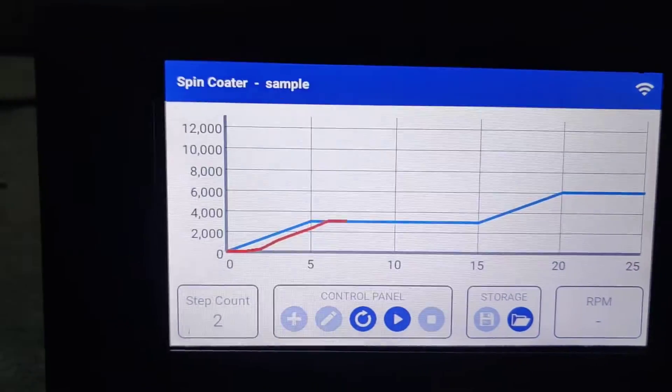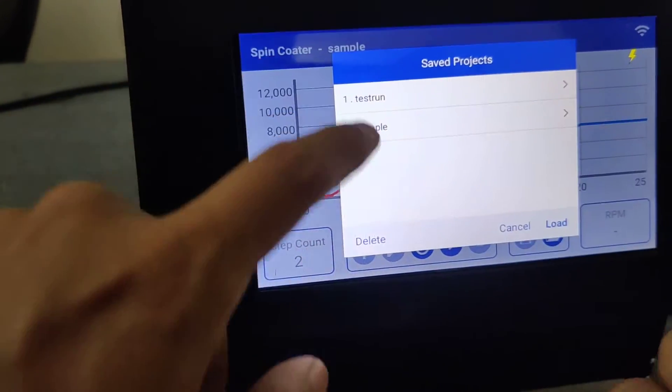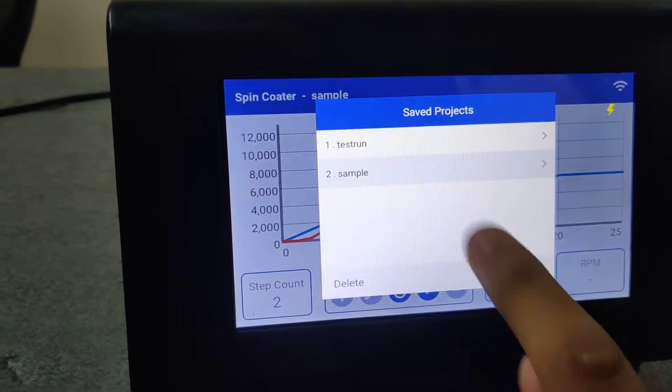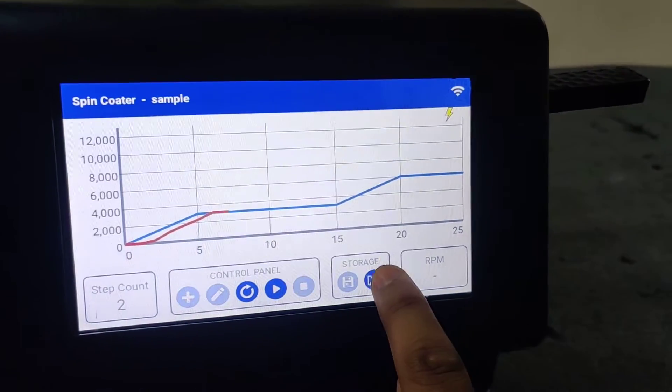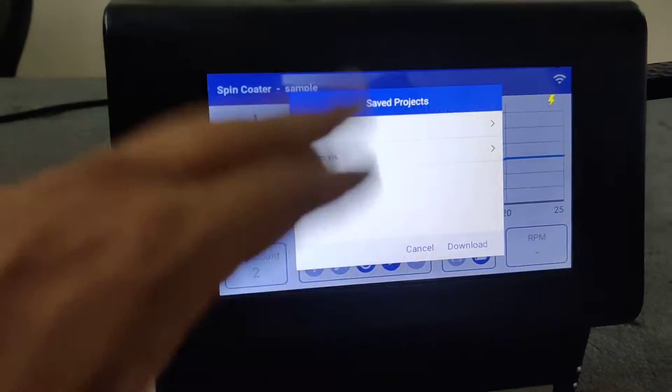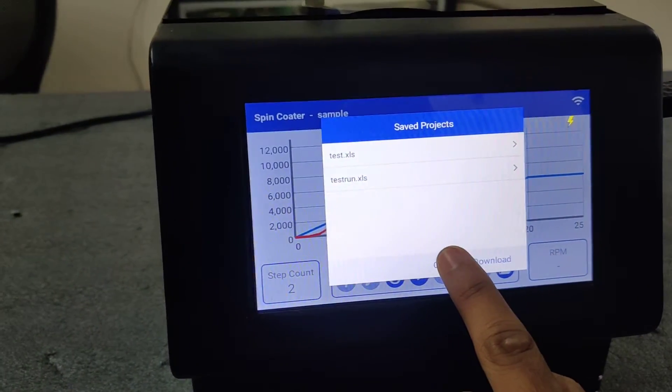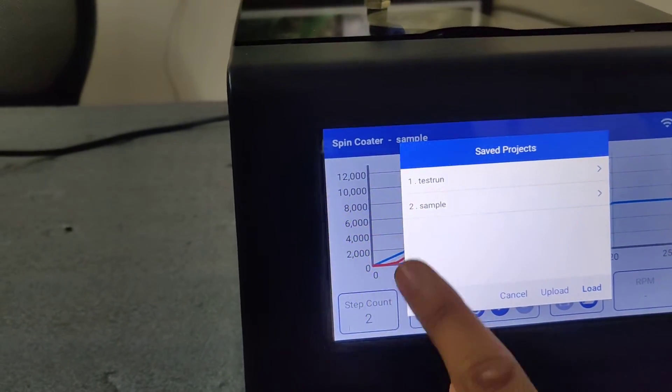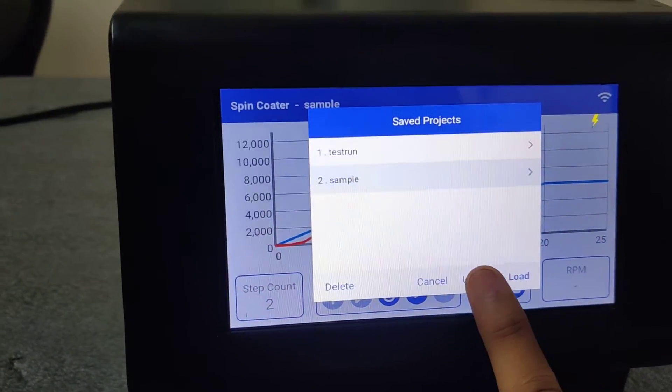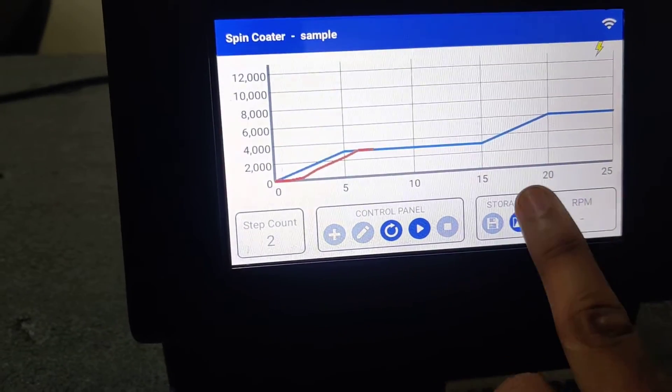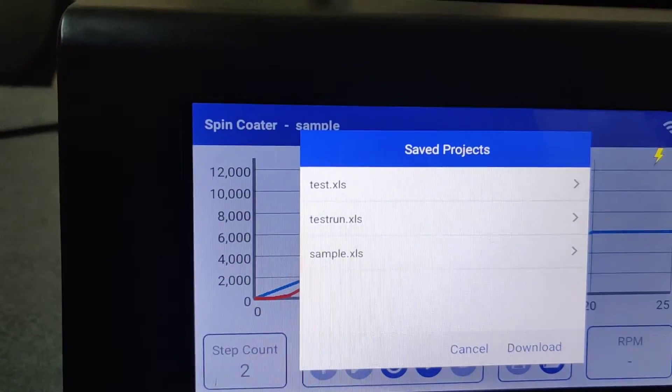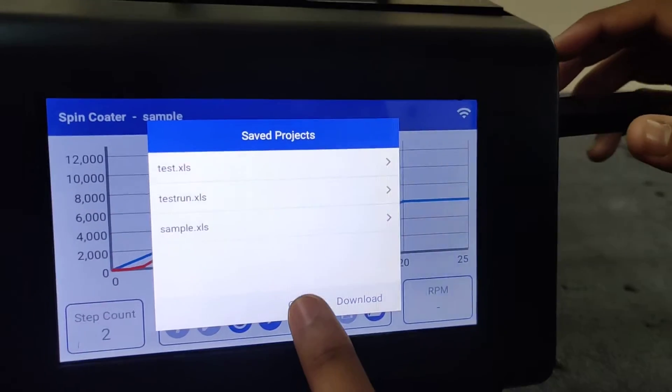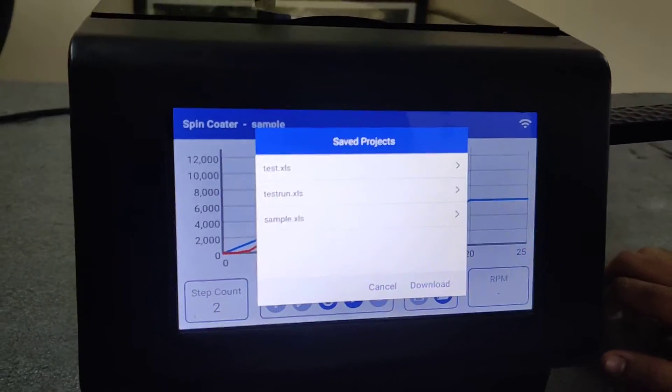Then go to folder internal. So you need to upload the sample program. Before that, we will see what is available in the external storage. External. So these are available programs in external storage. Now we cancel. Now we will upload the sample program. Upload project. Uploaded successfully. Now we go to the external sample. So it is there. So you can plug out your pen drive and use it. And it is in dot Excel as well, that means in Excel sheet you can edit those values and again plug it in the spin coater to use it.